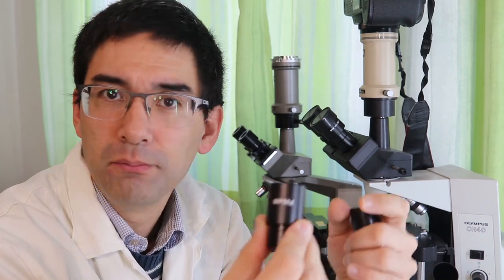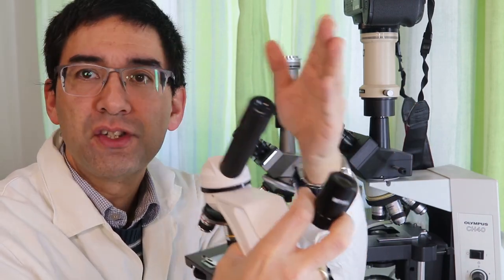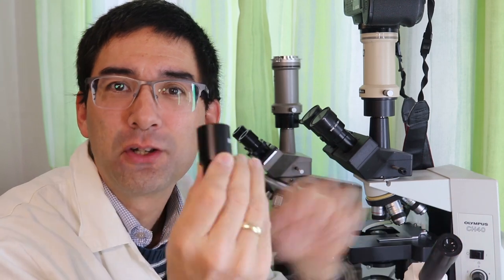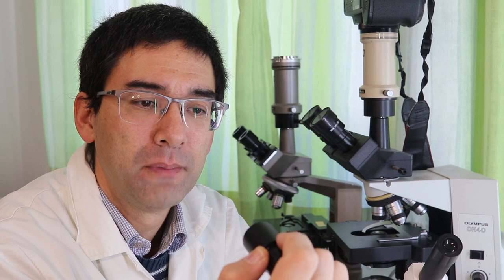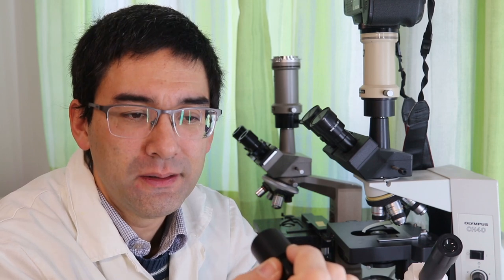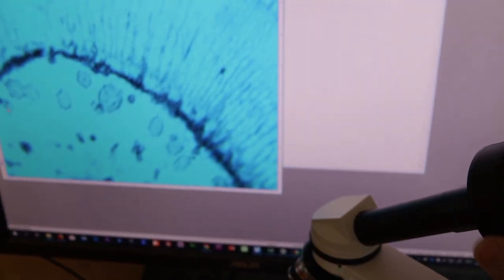Now, it is easily possible, as I've already showed you, here it is, to exchange an eyepiece with a slightly better one. That's easily possible because it's compatible, okay? Compatible, that's good. But those eyepieces also cost a little bit of money, so they're also not cheap, and that is the problem a little bit. Yeah, so that's a little bit disappointing. However, one of the things that you can do is, instead of an eyepiece, connect a microscope camera, and then you can actually do some microscopy on the computer as well.